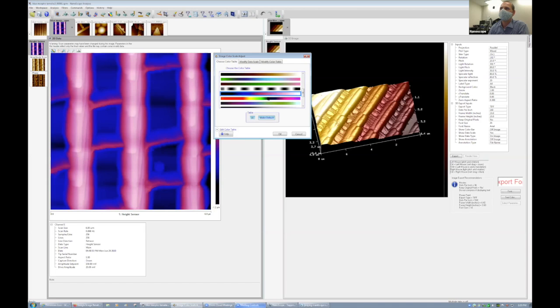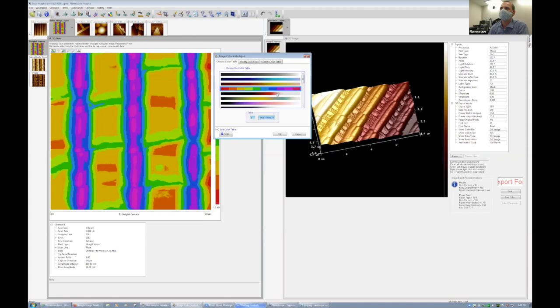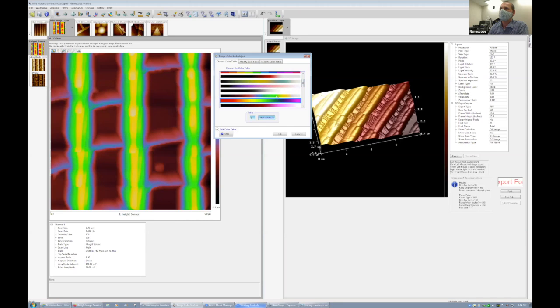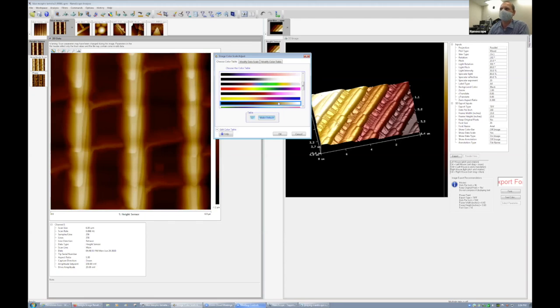So it's just like the electron microscope too, where it's really just detecting a signal. So it just has lots of signal, not a lot of signal. But what I think is cool about the color is this is the trademark AFM color. What is it? The Santa Barbara sunset, because that's where it was made. Yeah, Santa Barbara sunset.